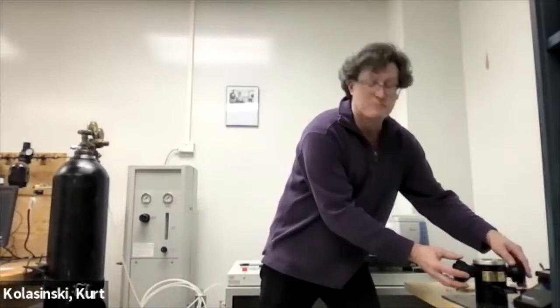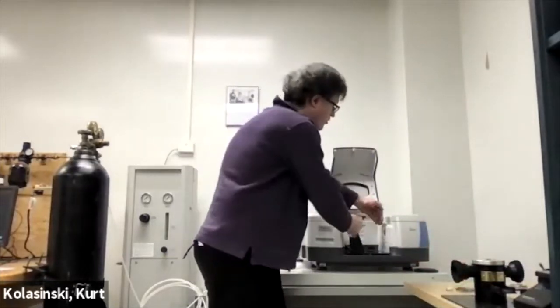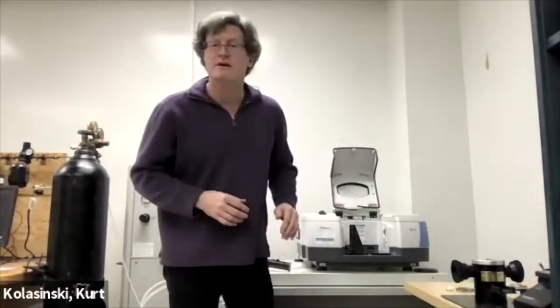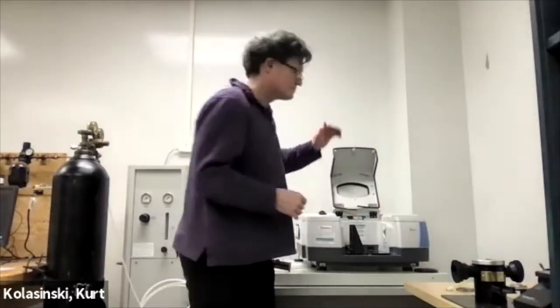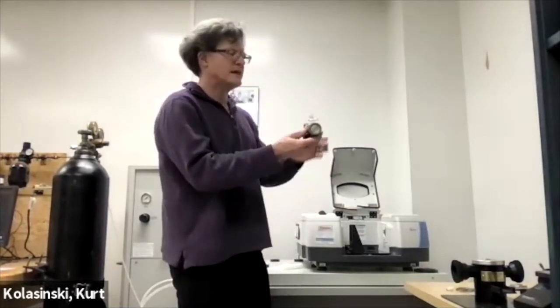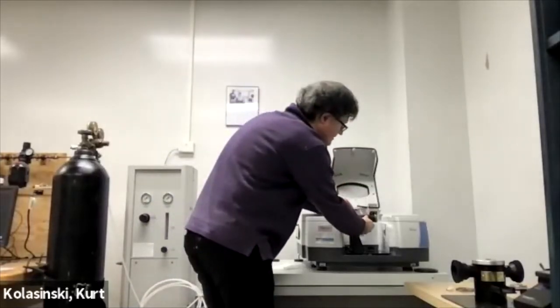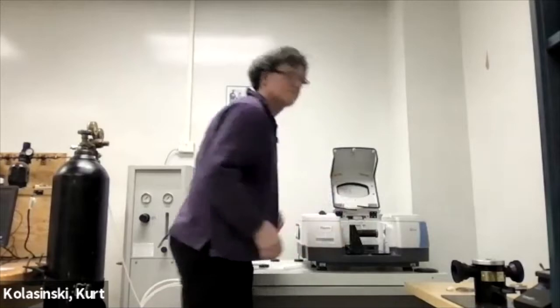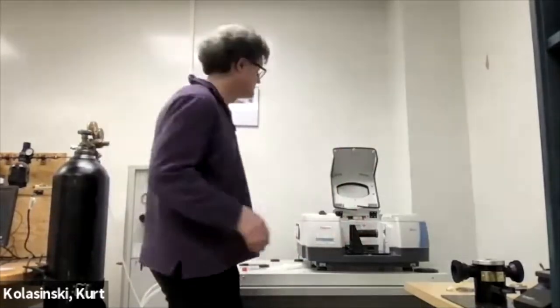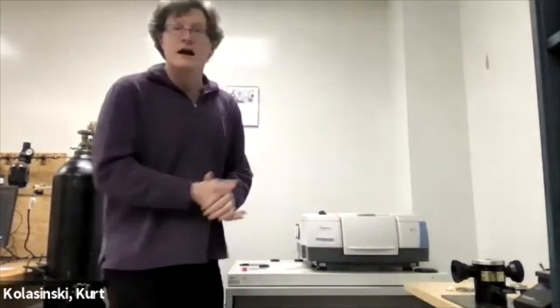After you put them in, first you can move them back, and then after you put those attachments in, you would move them all the way out so that they meet the body of the spectrometer. Then the cell is just going to slip right into here. Boom. There's a front slot and a back slot. Doesn't matter which one you use, just be consistent. All right. Then you close this up and you're almost good to go.